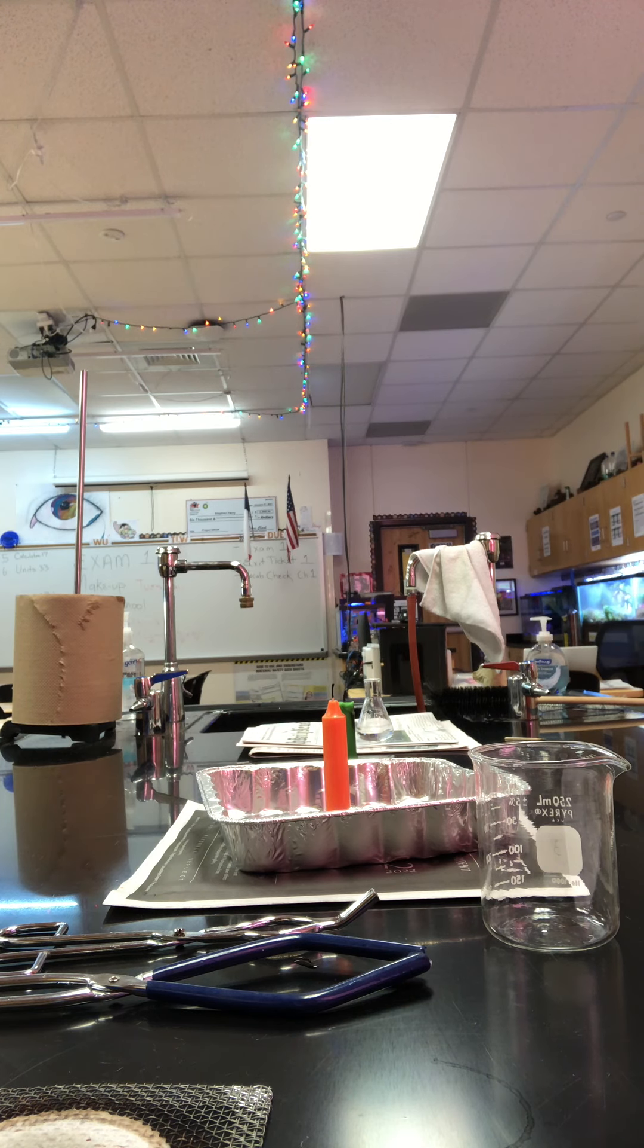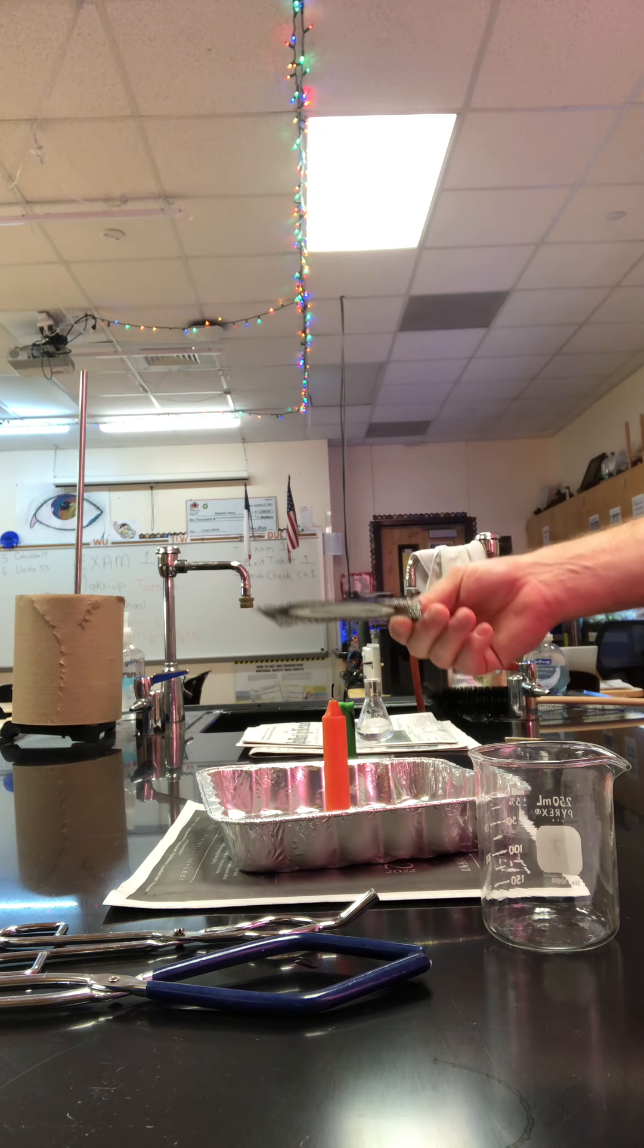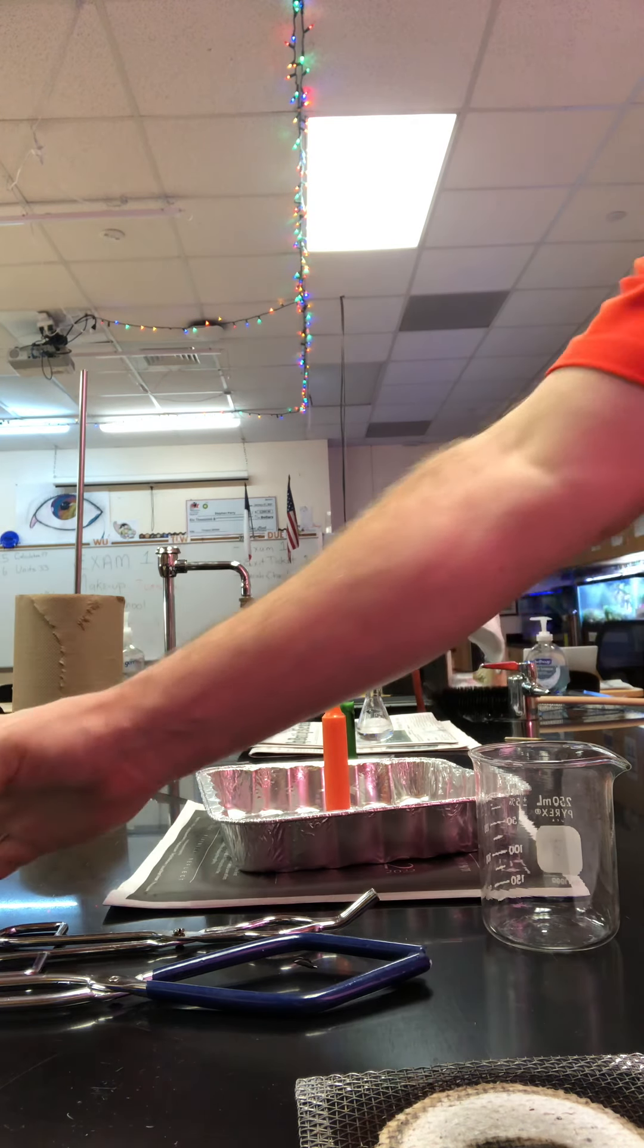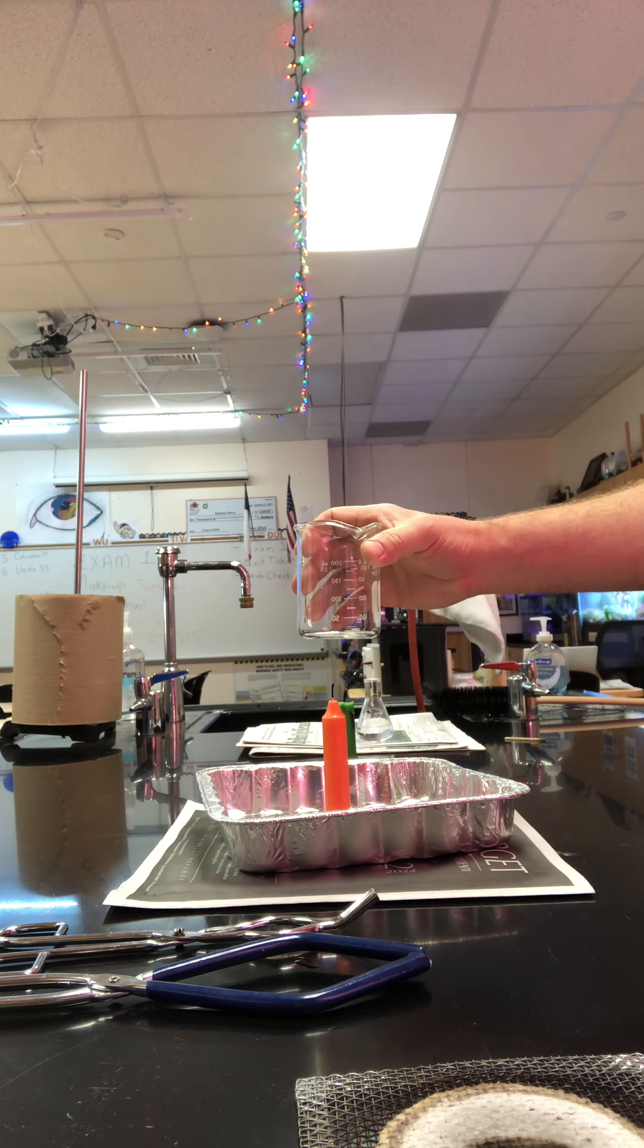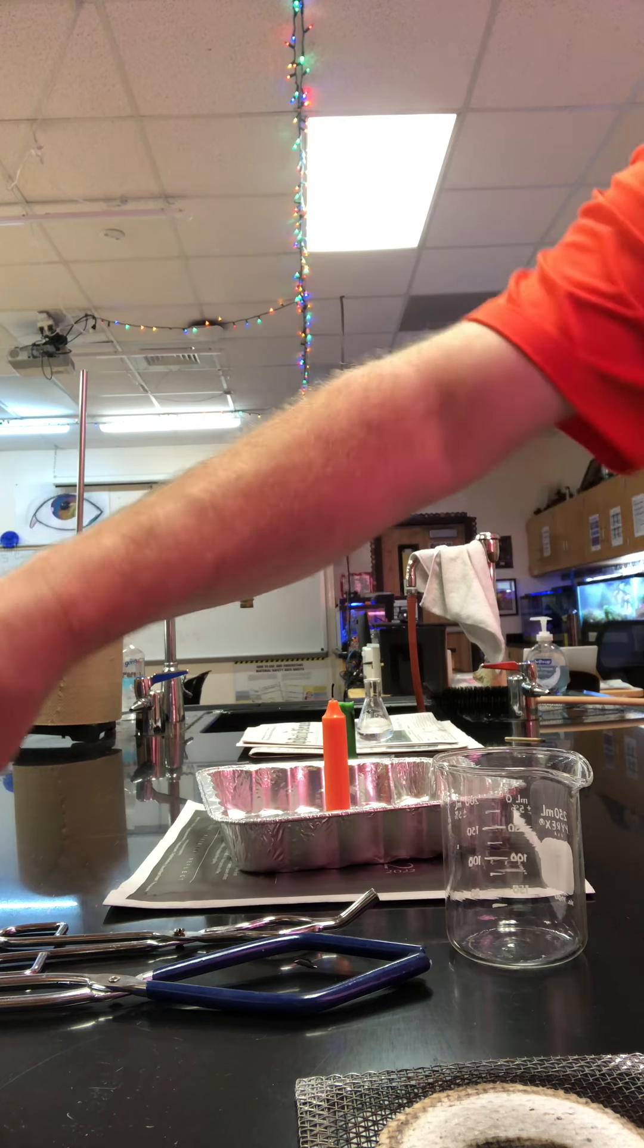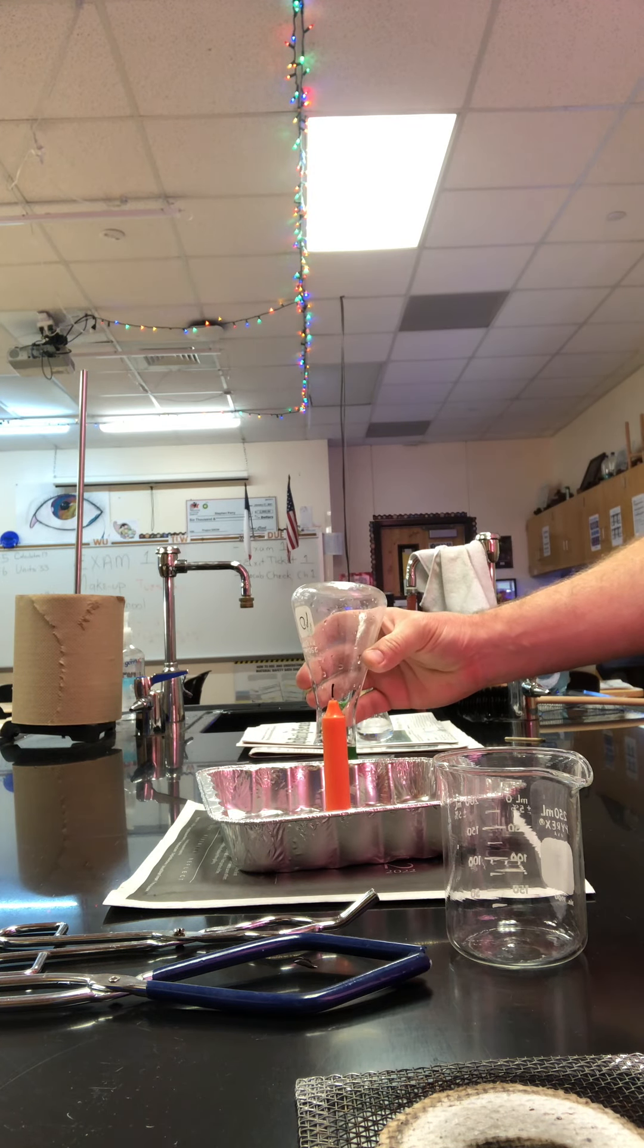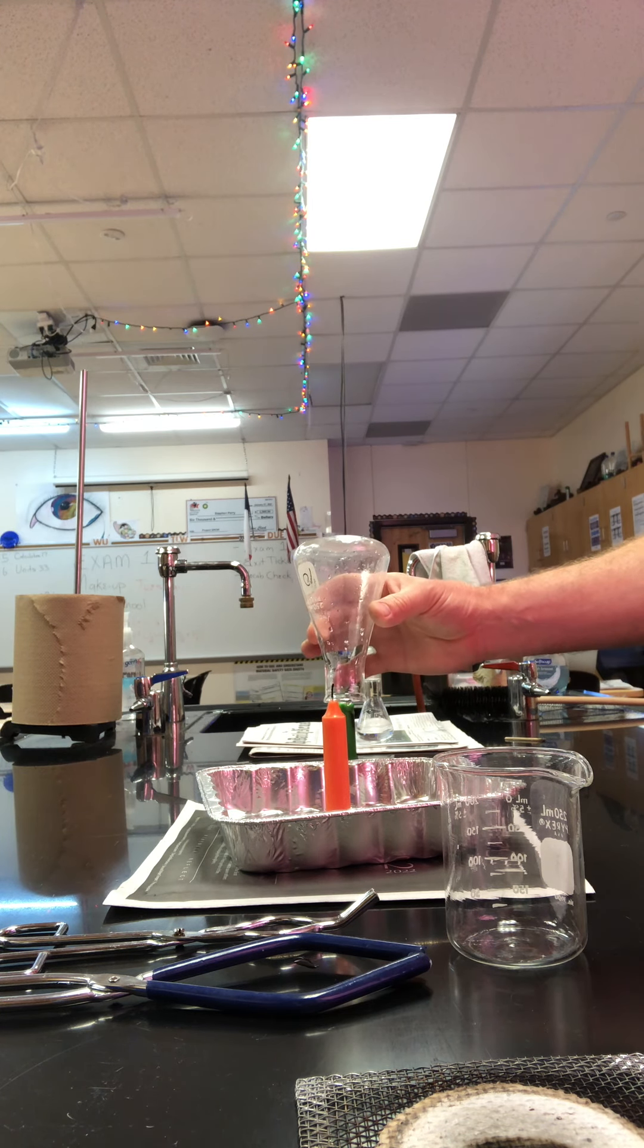So with the standing candle lit, we'll lower the wire gauze holding it with the tongs. You'll make some observations about what the flame does. Then we're gonna add water to the beaker, hold the beaker over the candle, make some observations about that. Then we'll add water to the pan, turn our Erlenmeyer flask over, put it over the candle, and watch what happens.